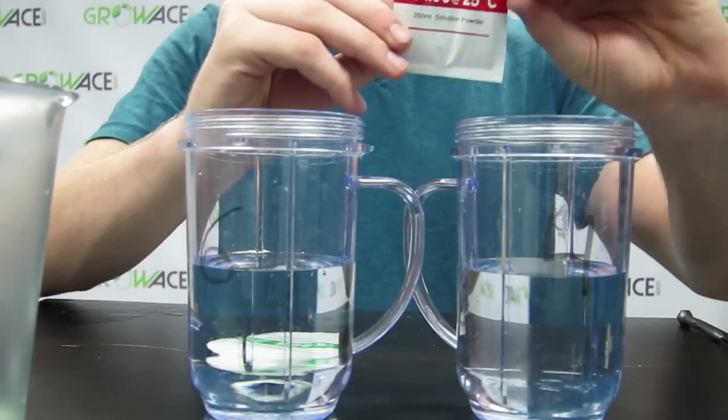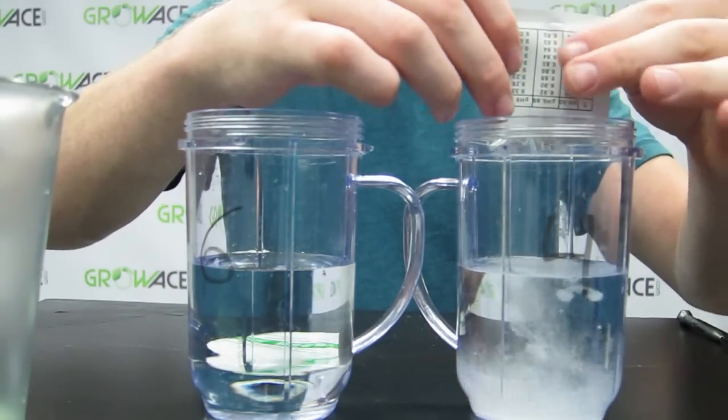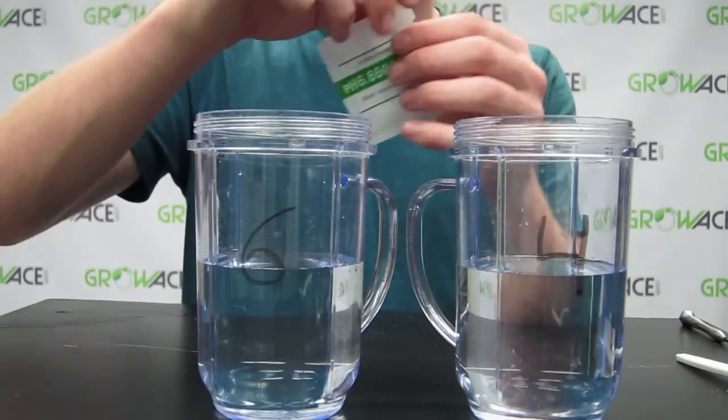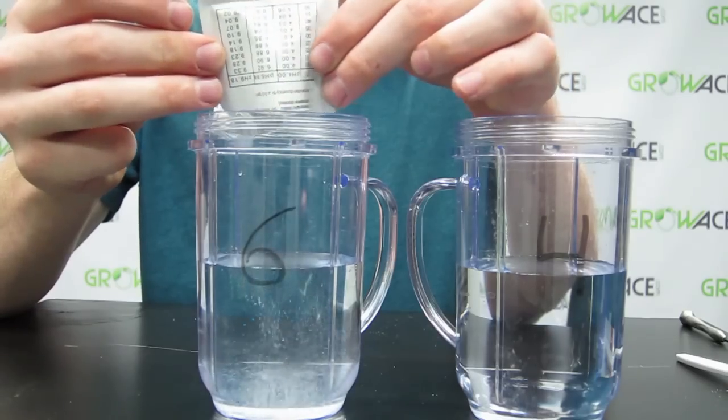Grab the number four cup and add the pH 4.0 buffer powder. Gently stir until it dissolves. Grab the number six cup and add the 6.86 pH buffer powder and gently stir until it dissolves.